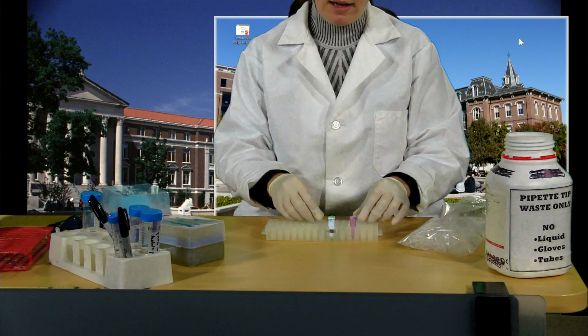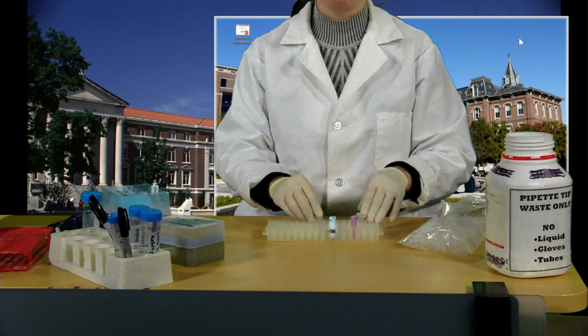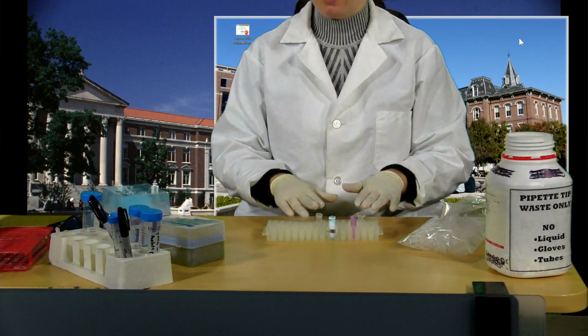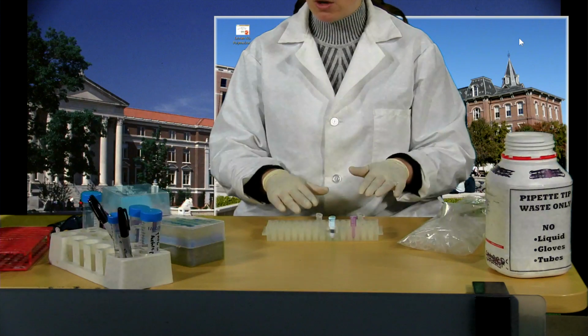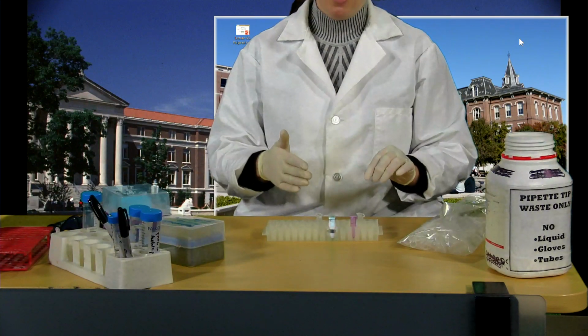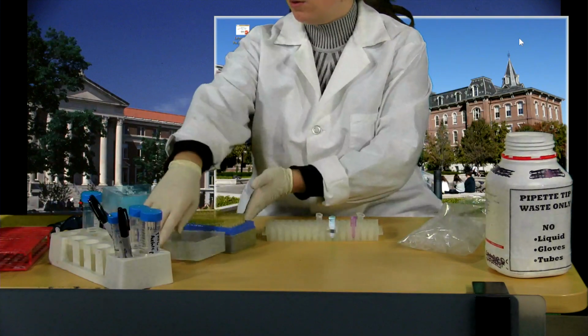I like to call it giving back to the universe. The universe will take its cut. You'll be a couple of microliters short if you do it that way. And so instead I'm going to make up 200 microliters of each of these. And so I'm going to start by putting in the small volume, and then when I put in the diluent, that larger volume will actually mix through the small volume for me. So let's go ahead and start this.